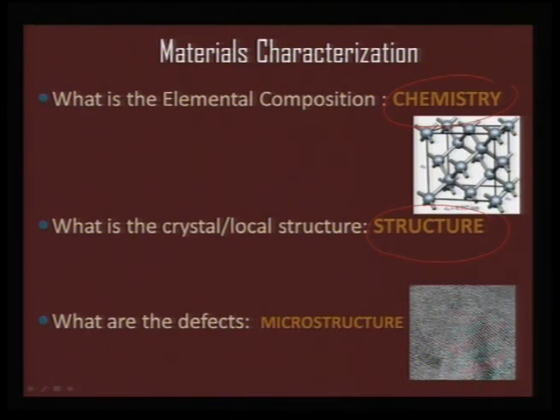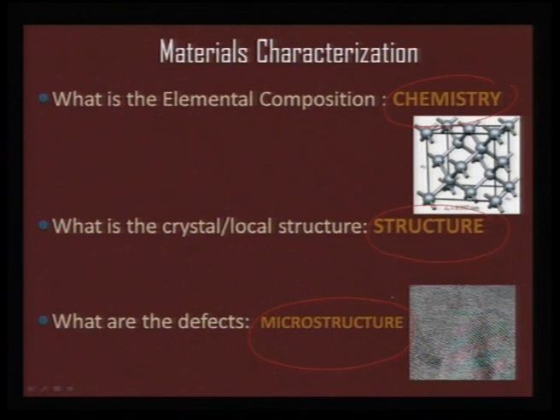We have already seen the principles of X-ray, and also when we want to look more carefully into the microstructure, then we look at the imaging tools. In today's talk, I will be first talking about almost the first invention on imaging tools, that is the scanning tunneling microscope, which almost brought a new focus into material characterization, because until 1986 SEM and TEM were the only tools which were popular to study the microstructure of any given solid. One of the major benefits of this microstructure analysis is to see how the defects are oriented in a given sample. So, mainly the defects in a solid can be mapped using the microscopic tools.